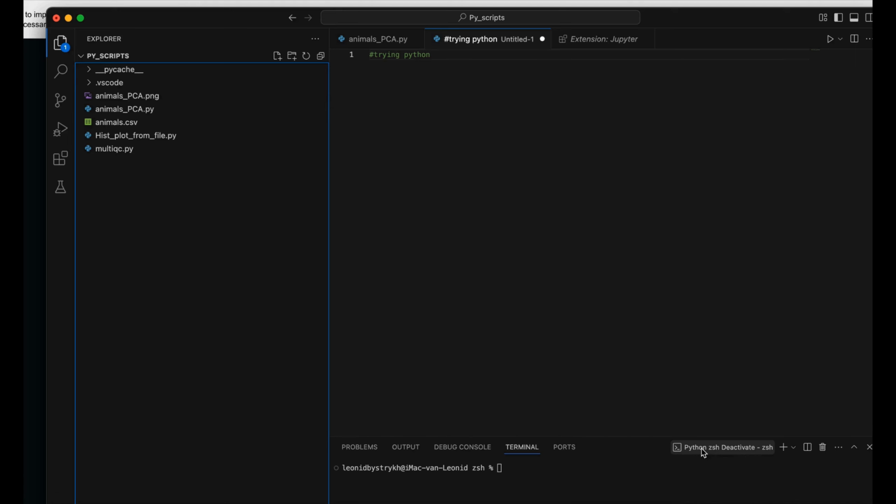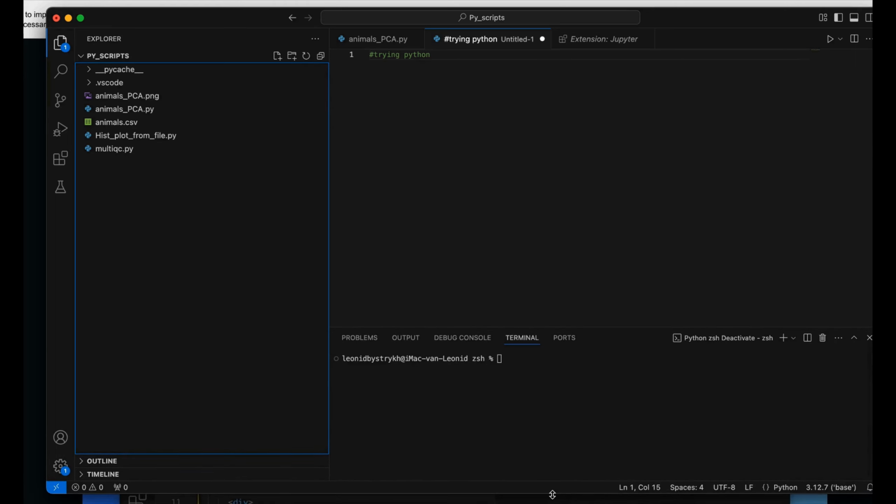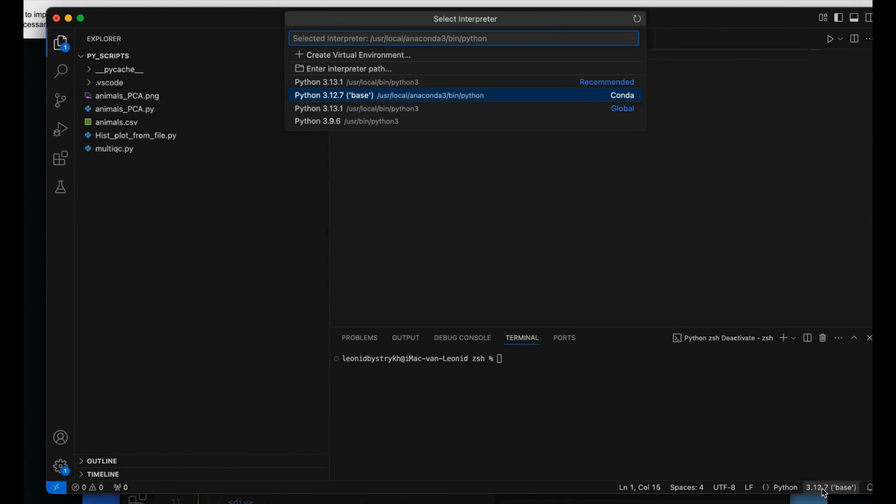What is important here, let me show you this corner. In this bottom right corner, there is a selector for which Python you use. It will show you all the Pythons installed on your computer. Remember that Anaconda Python is yours. You can torture it endlessly and then remove it if you don't like it, but do not touch others. This /usr/bin/python3 is a system one.